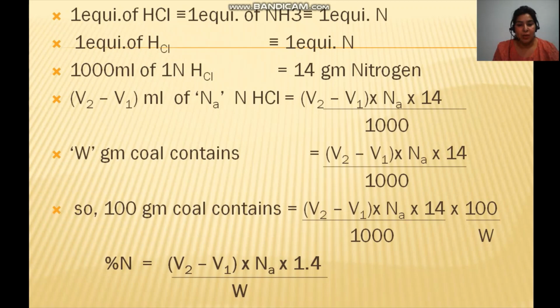So this is about how to determine the percentage of nitrogen in the ultimate analysis by the Kjeldahl method.